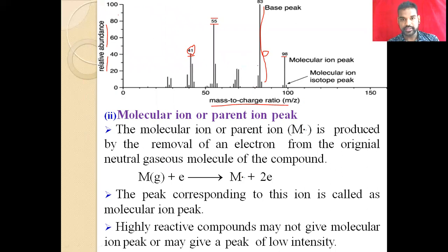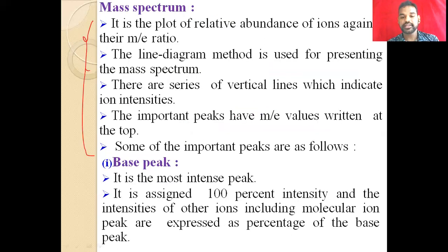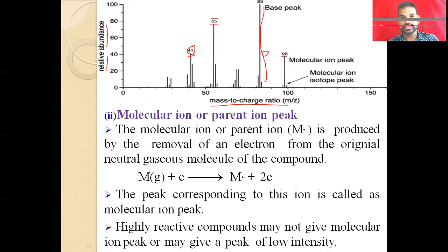Okay. And then normally what they will do is assign the base peak as the 100% intensity. That means they note this base peak with the highest intensity as 100%. That is the maximum intensity in a compound, so it is 100% of intensity.